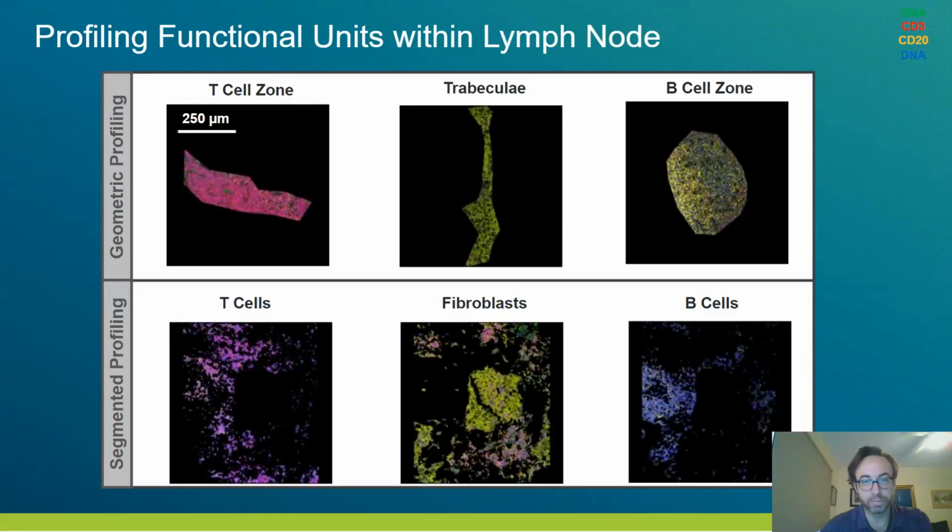And what you can see, the difference in terms of how these are built, the ones collected at the top collect every single cell within a region, regardless of its cell type. The ones that are from the segmented profiling are going to be focused really on the cells that specifically express a particular immunofluorescent marker. Now, we wanted to go through and confirm that what we're collecting makes sense biologically and can help us drive how we look at comparing these different regions of interest.